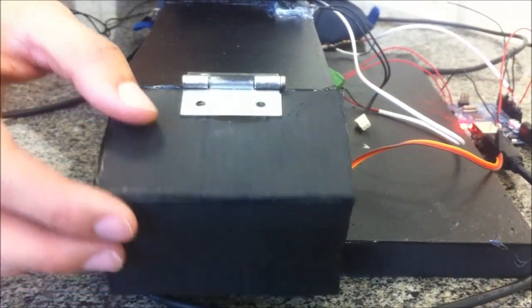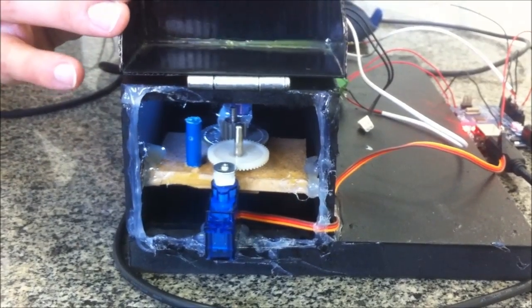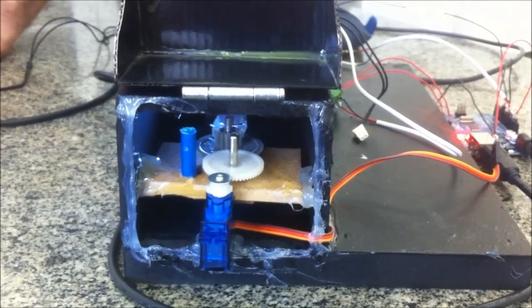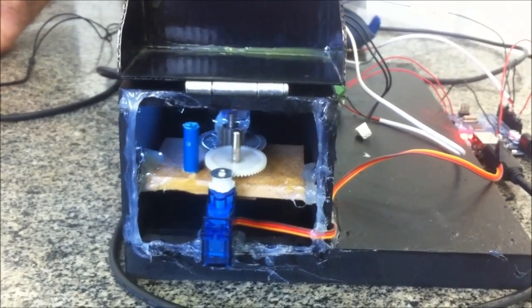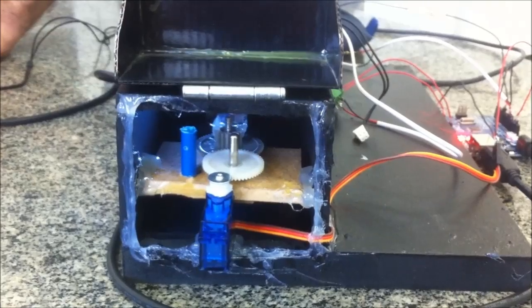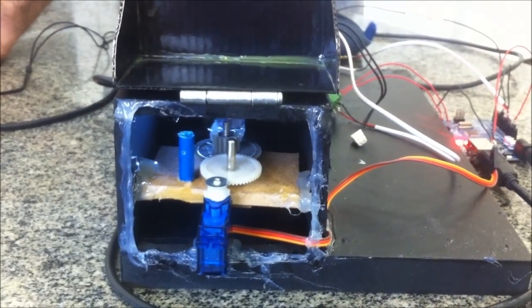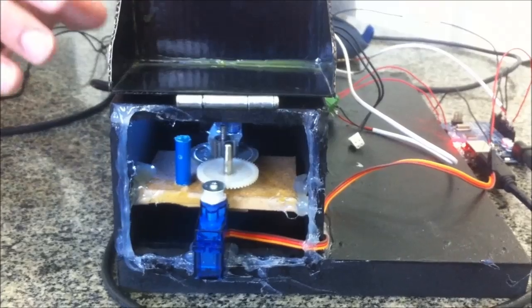It took two steps for me to build this one here, which were setting up a monochromator that separates the white light in a rainbow and selects a single light beam. This was done by controlling a servo motor that spins a mirror prism.